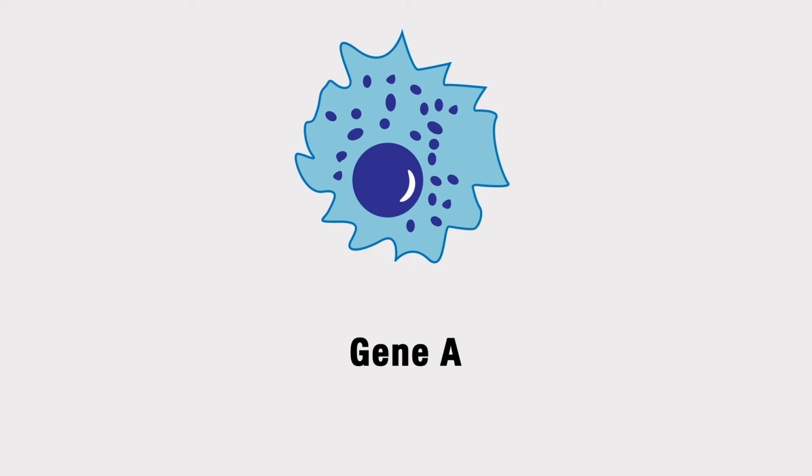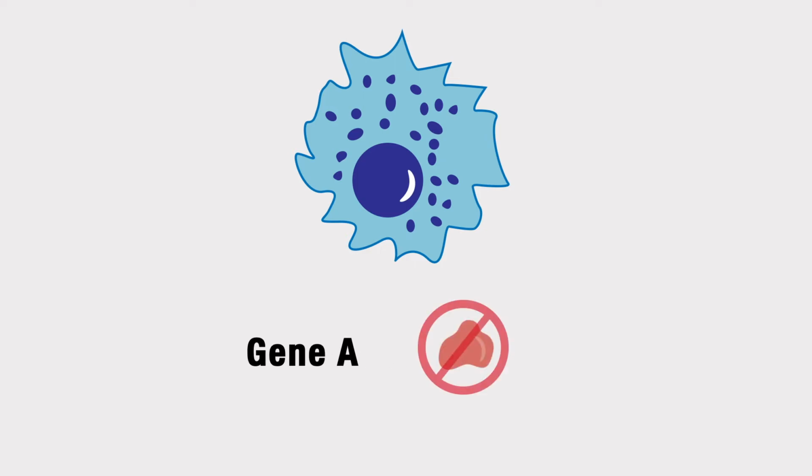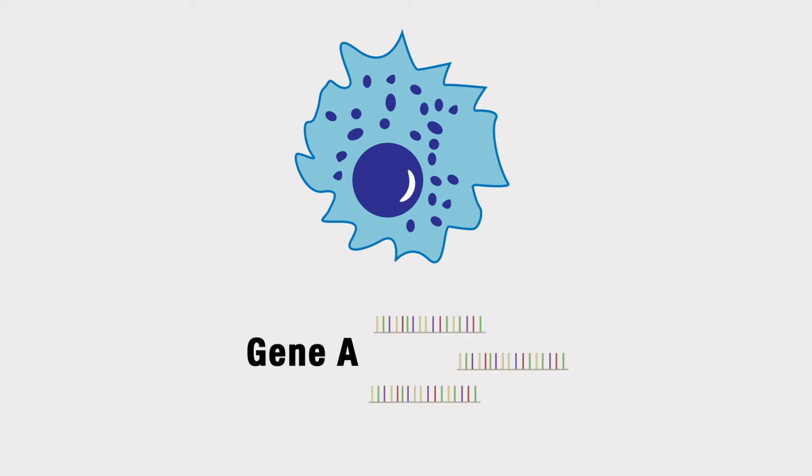This is a novel gene, so we don't yet have the means to analyze its protein abundance. However, we can get some preliminary information about the role this gene is playing by looking at transcript levels. We want to know if the expression of this gene increases, decreases, or remains constant throughout the aging process.